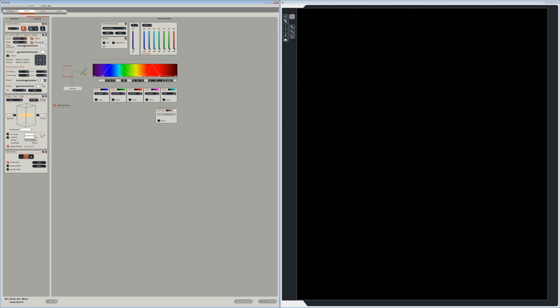These are the lasers that we have in our microscope. We do not have a 594 laser or a 555. So there's a gap here. If you have that fluorophore, it will not be excited properly. And just keep that in mind.